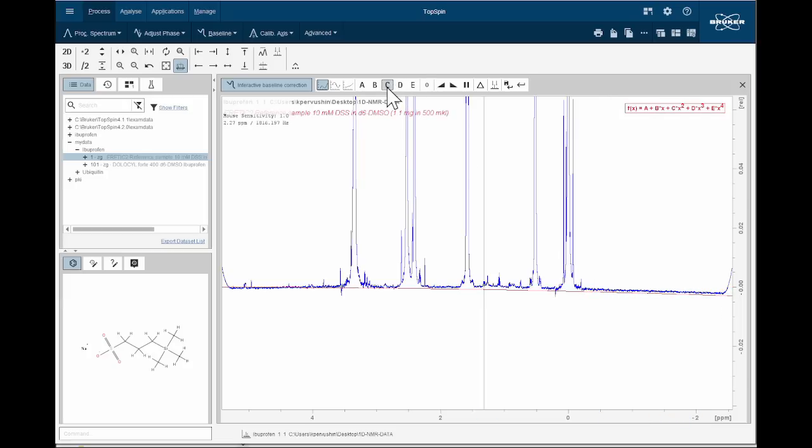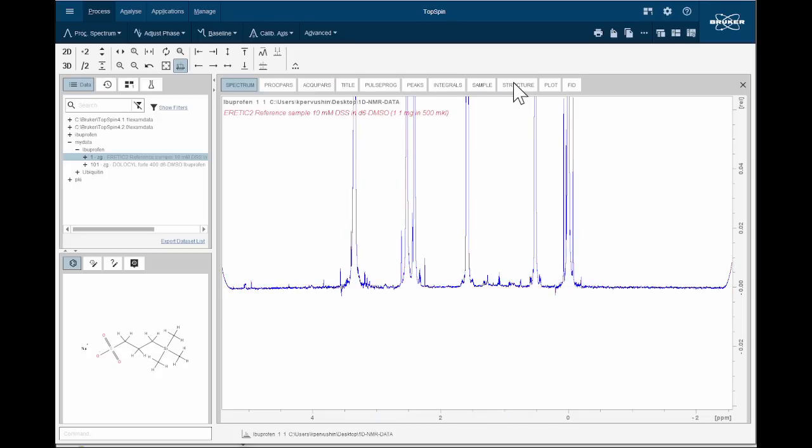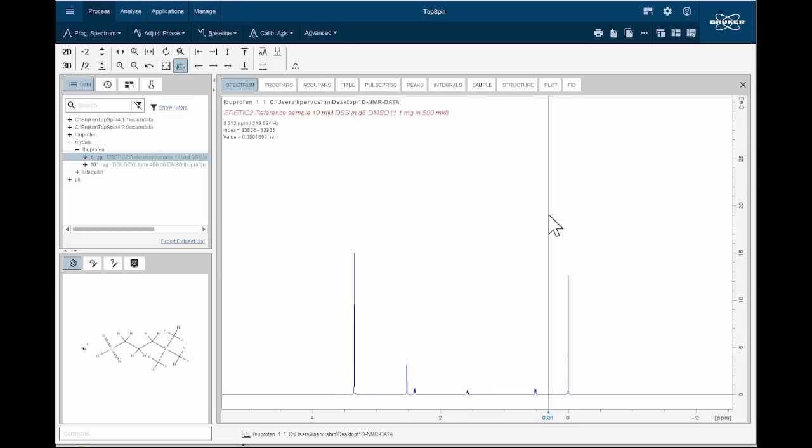It usually takes a few steps to reach a satisfactory correction level, like this, for example. Yeah, you can see my baseline is tracing the noise line pretty tightly. So now I can calculate the difference and save it. Okay, so now I return to full spectrum.